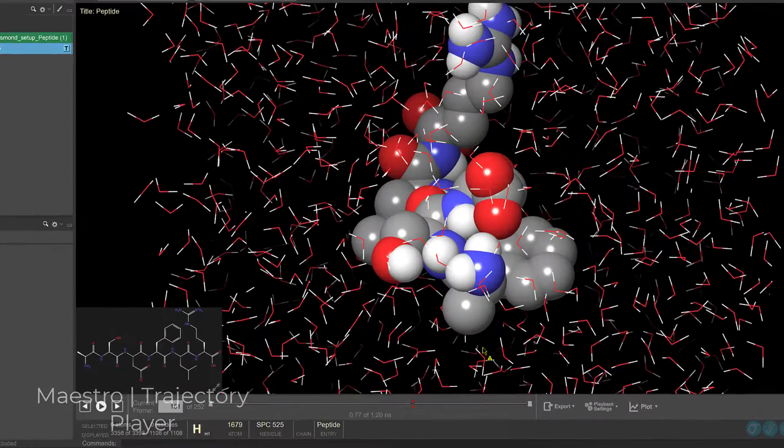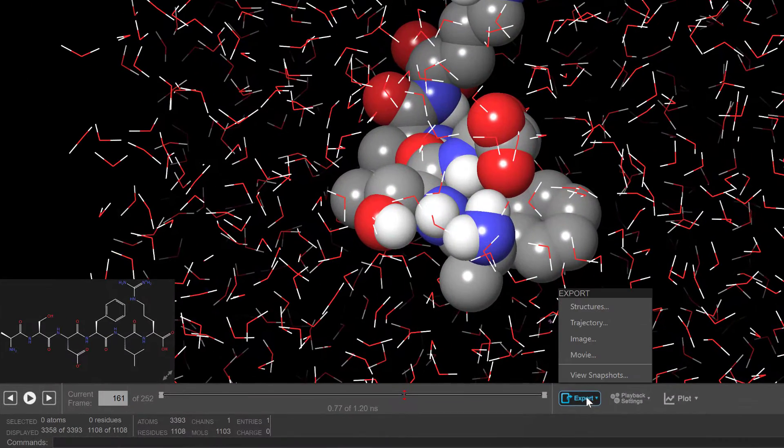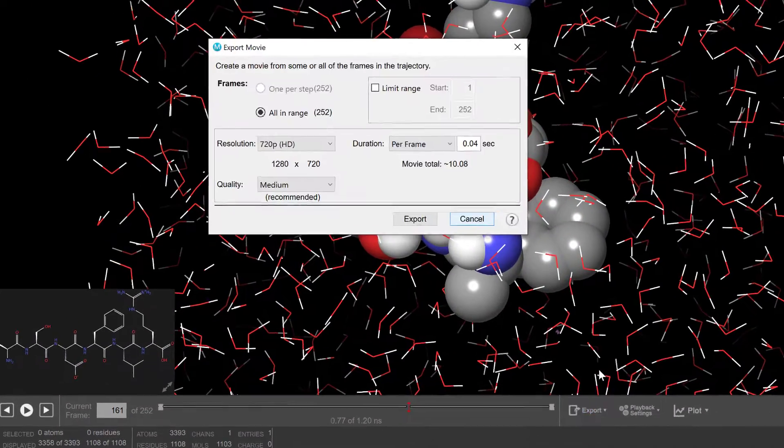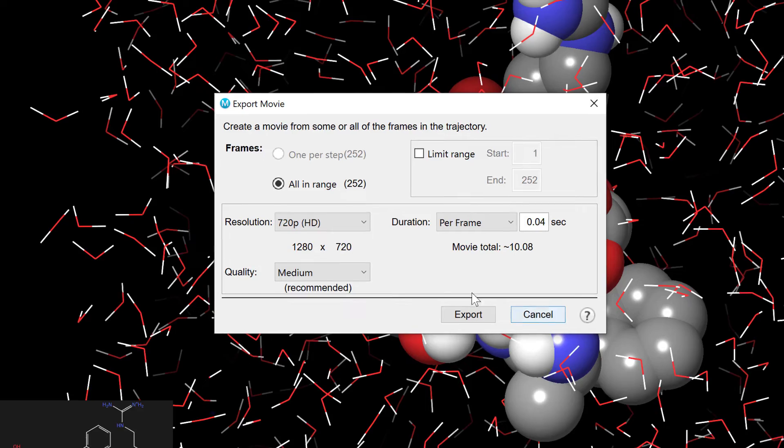In the Trajectory Player, one can now export movies in a variety of higher resolutions.